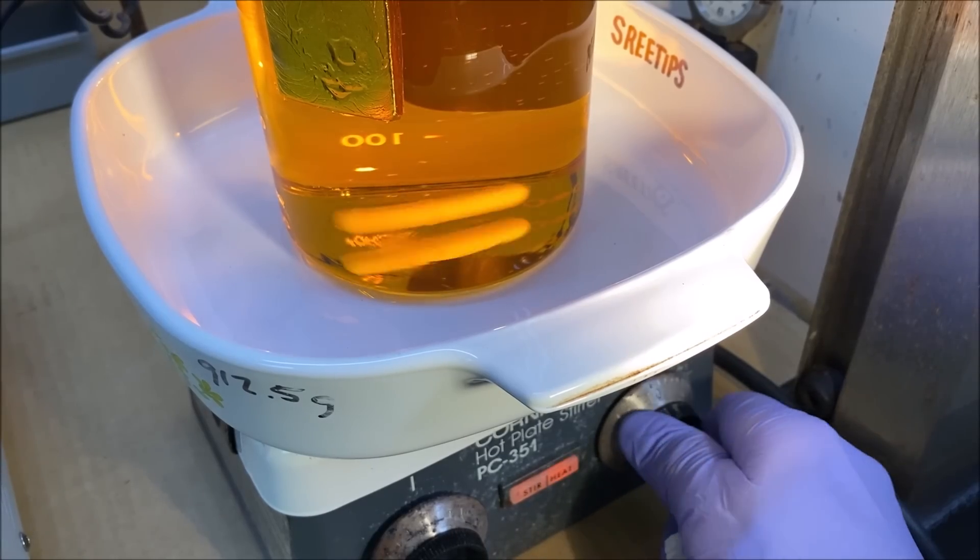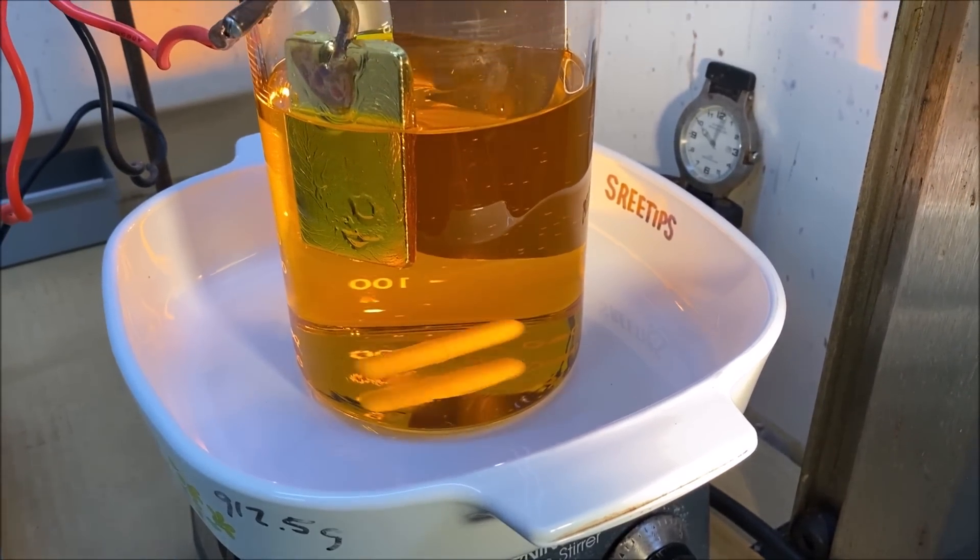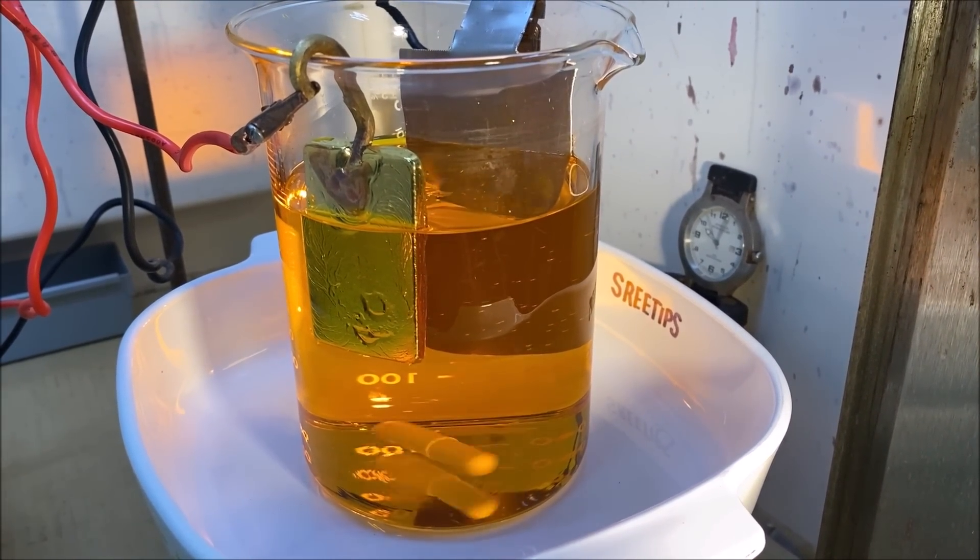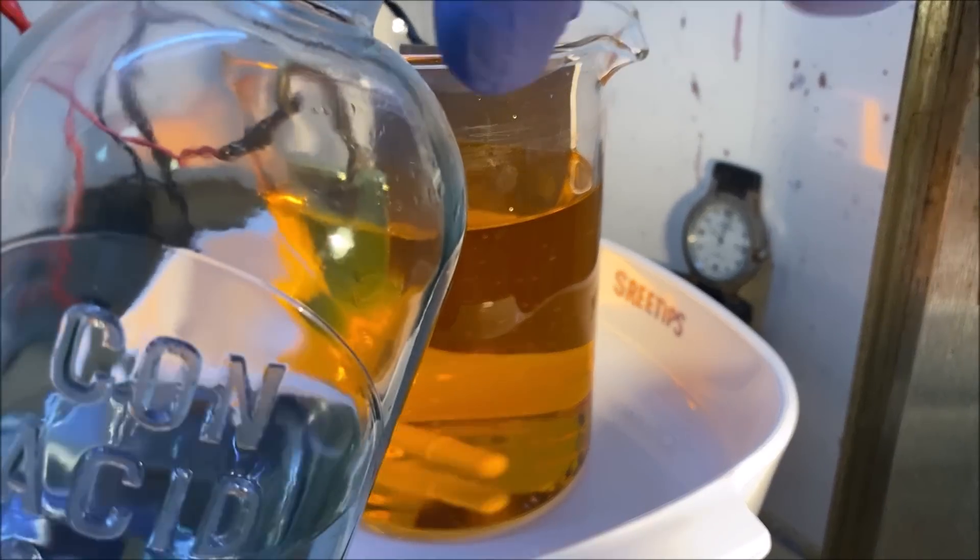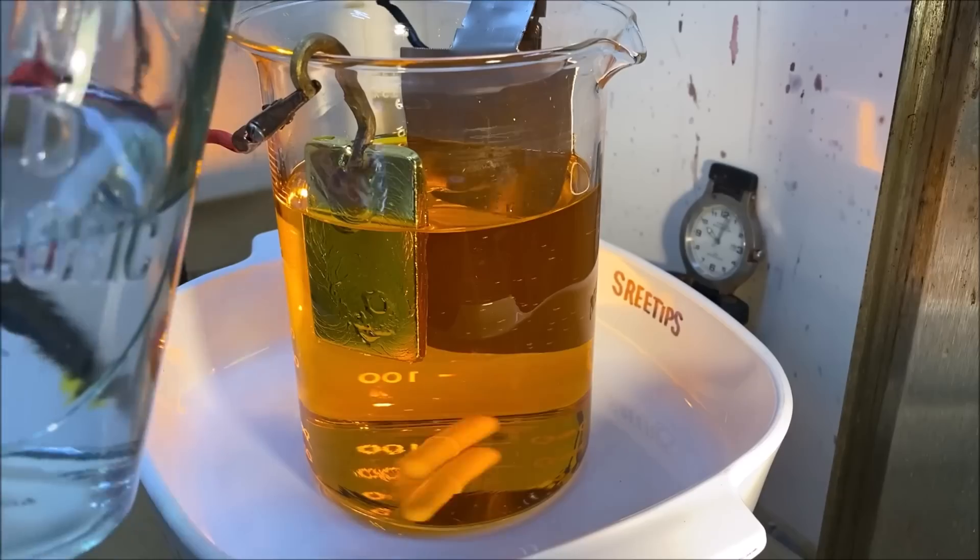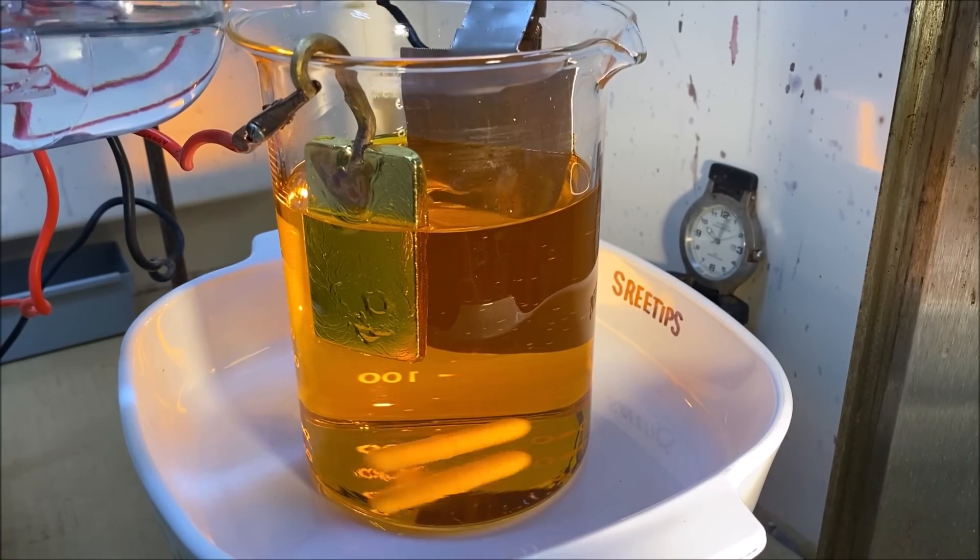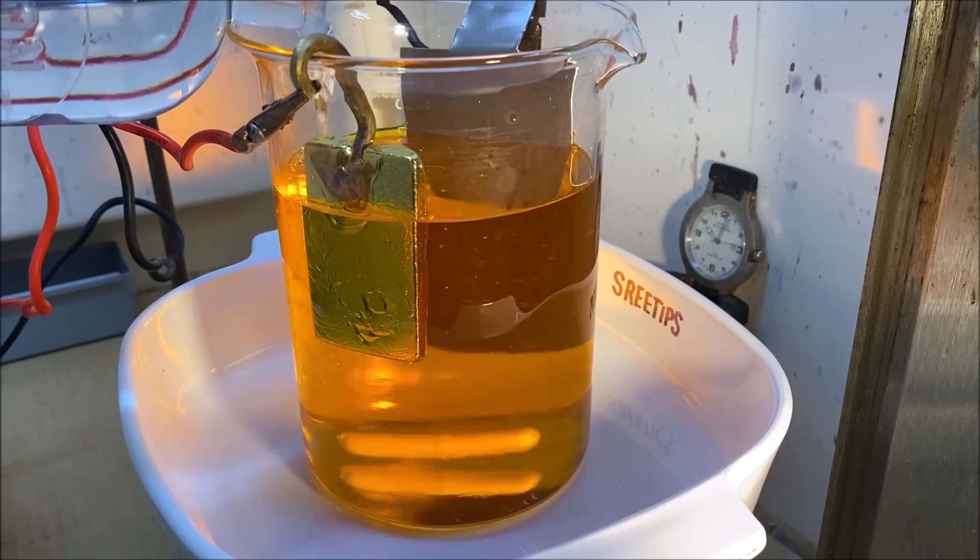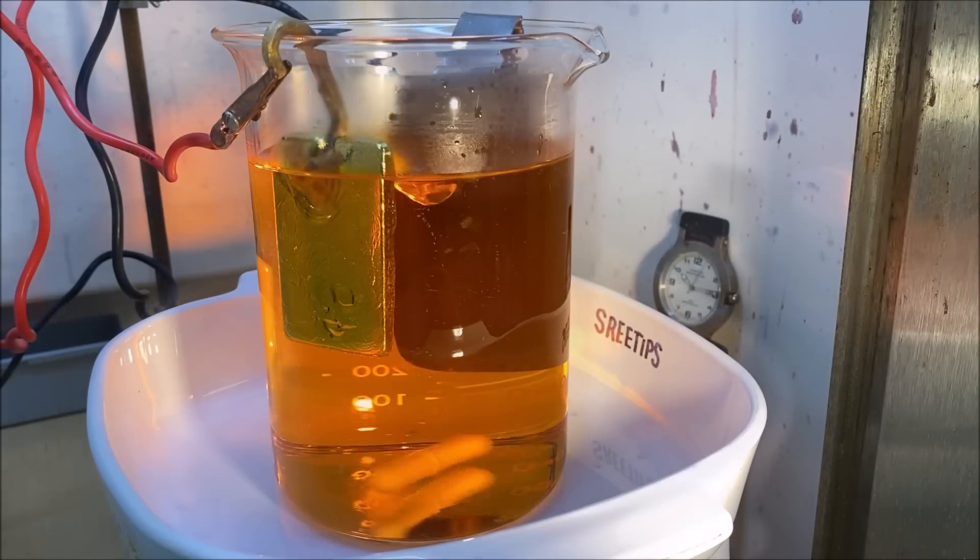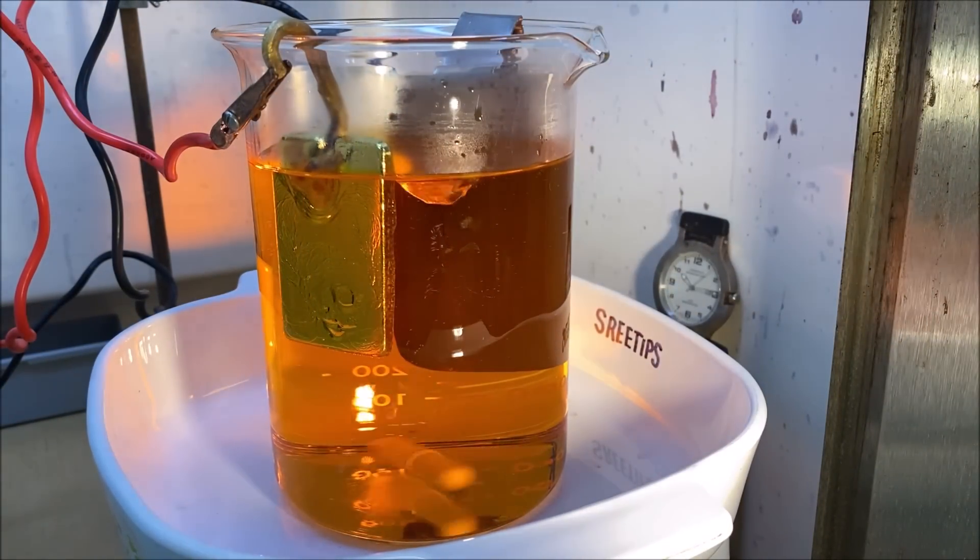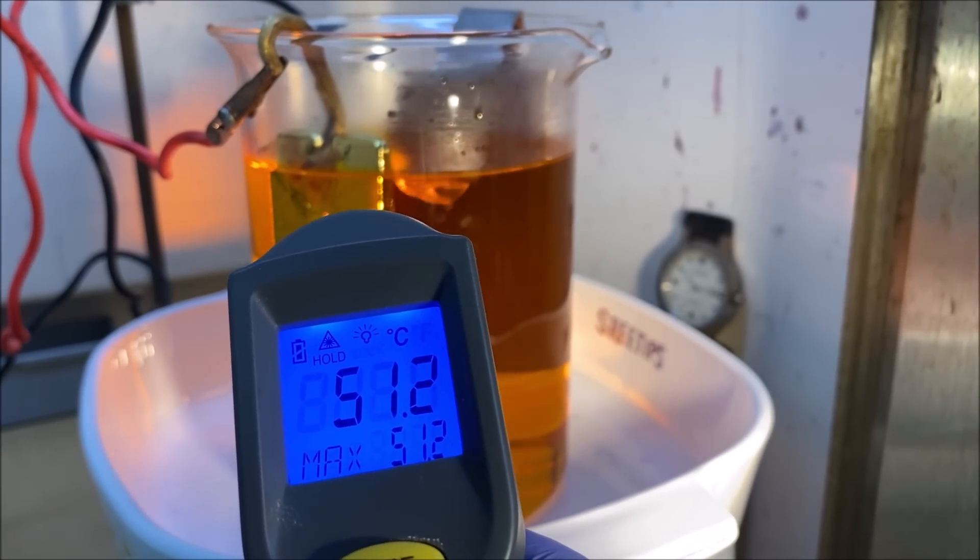I'm going to add some low heat to start heating the solution up. We want to try to get it up to 140 degrees Fahrenheit or 60 degrees Celsius. Now I'm adding about 100 milliliters of hydrochloric acid because that's what the recipe called for. Let's check the temperature: we've got 124 Fahrenheit and 51.2 Celsius, so we're almost there.